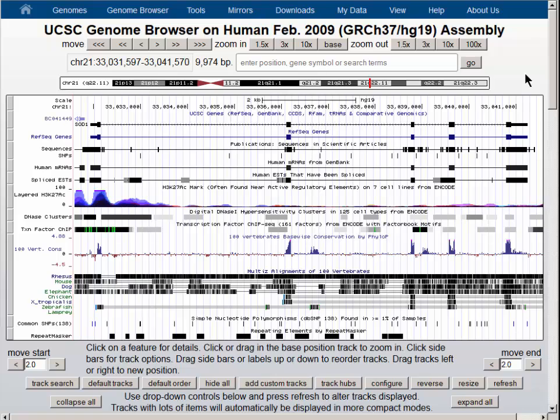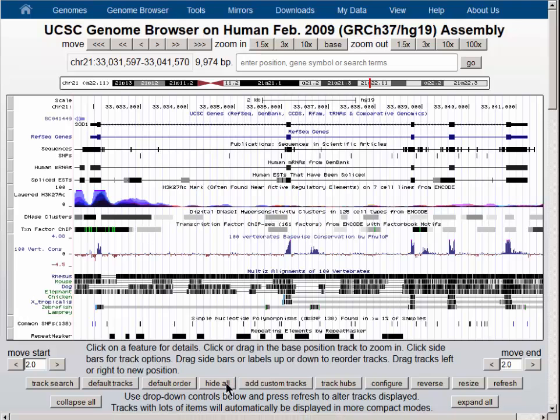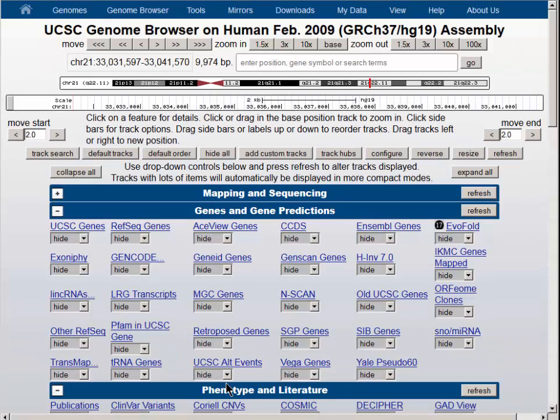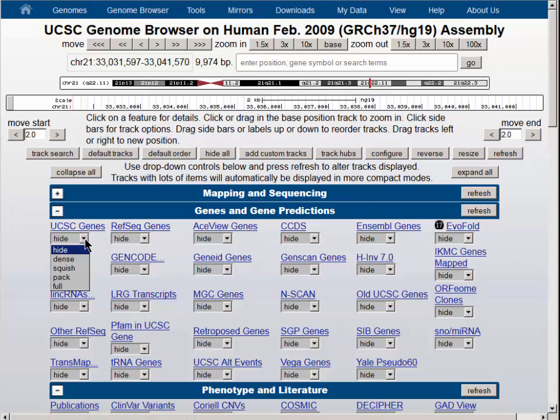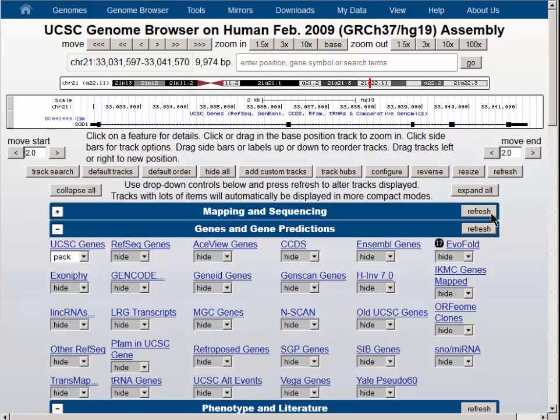The browser shows a large number of data tracks. We'll start by hiding all of the data tracks, which simplifies the view. And then we will turn on the UCSC Genes Track to pack. That will show us a single gene at the default location, the SOD1 gene.